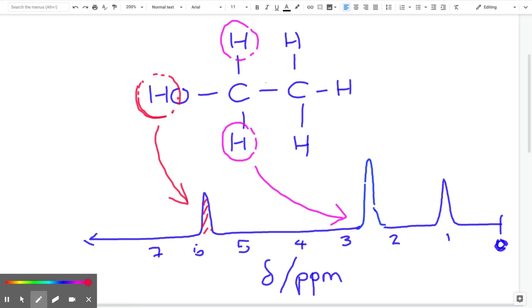Now, that's strictly not true. What we would see is a peak where the area underneath the curve was twice as much as the area under the curve of the red one. Likewise, we wouldn't see the same peak over there. What we would now see is a peak 3 times bigger, but not necessarily 3 times higher, but with an area that is now 3 times bigger underneath the curve, underneath the peak.